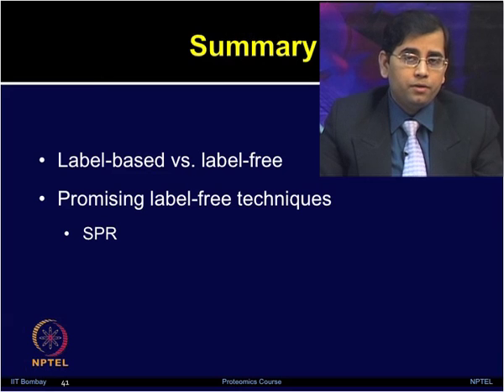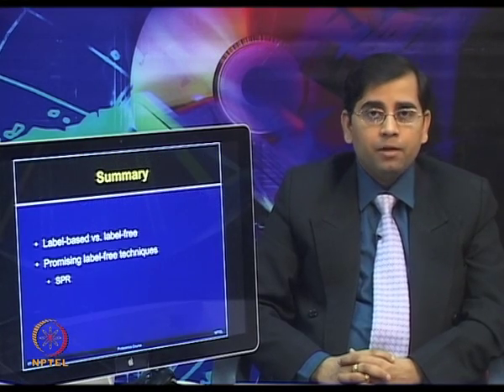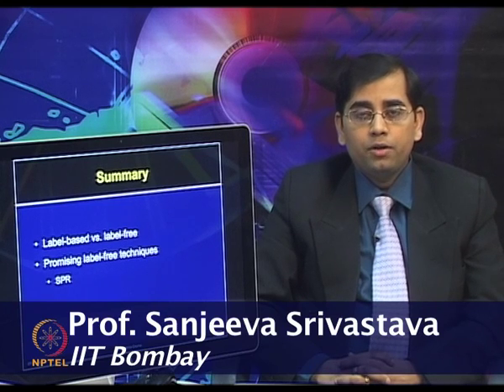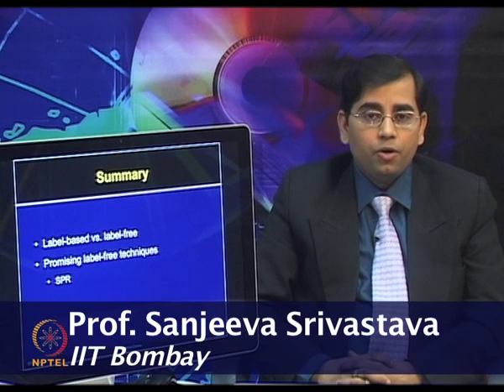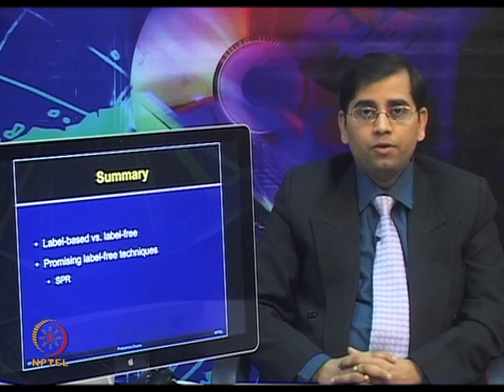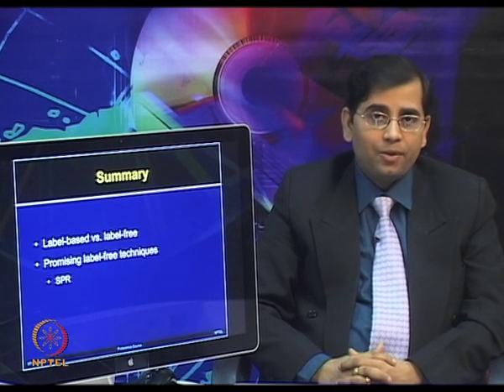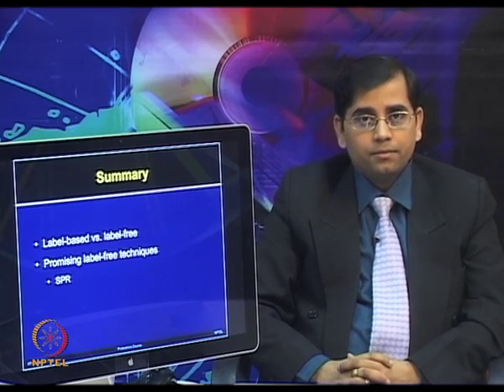We discussed the strengths and weaknesses of label based and label free techniques. Then we started discussing some of the promising label free techniques such as surface plasmon resonance. We will continue our lecture on surface plasmon resonance and surface plasmon resonance imaging as well as other label free techniques in the following lecture. Thank you.